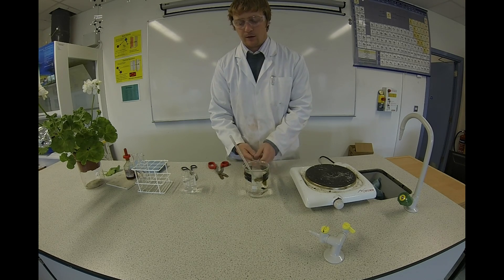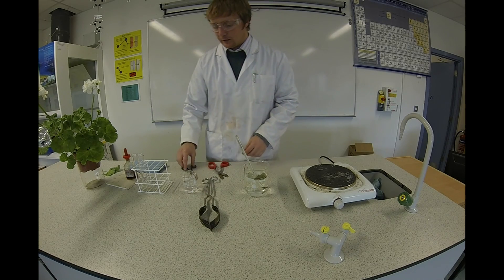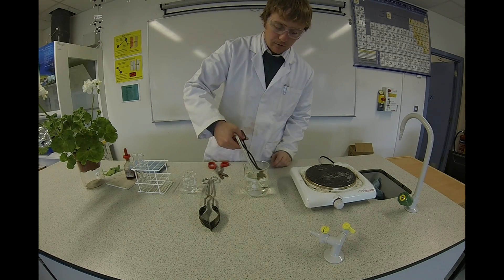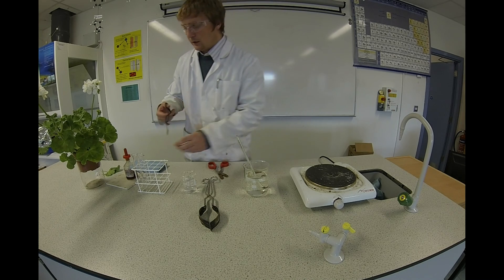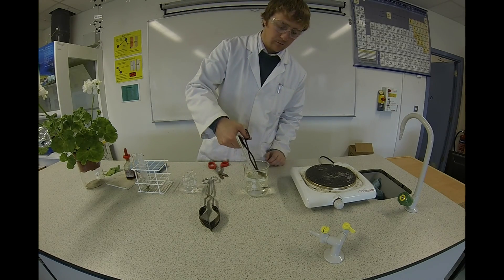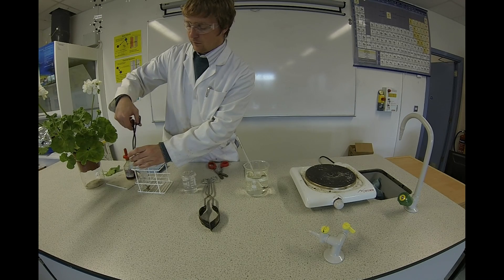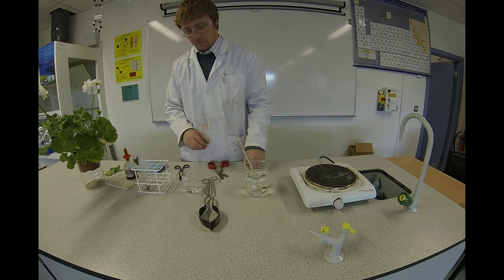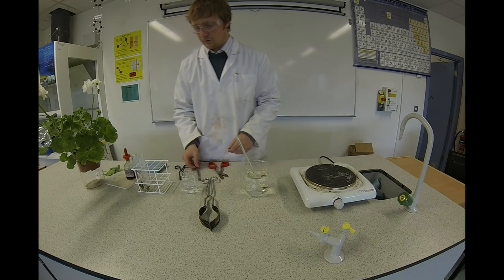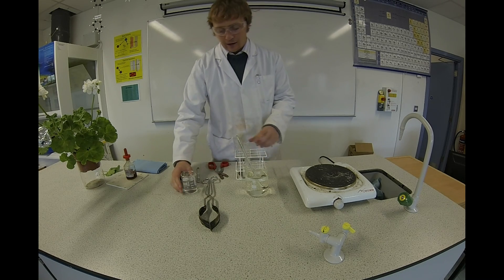Now I'm going to remove the leaves and place them, one each, in a test tube. Then to each test tube I'm going to add some alcohol.